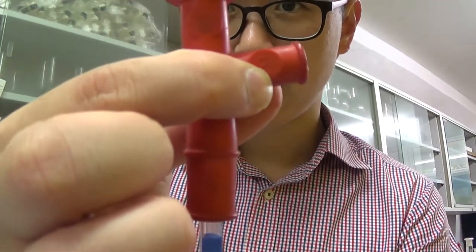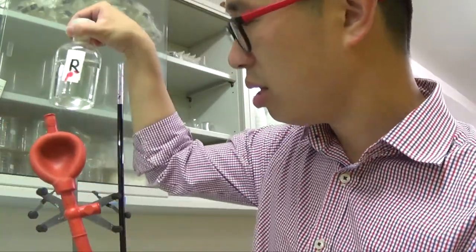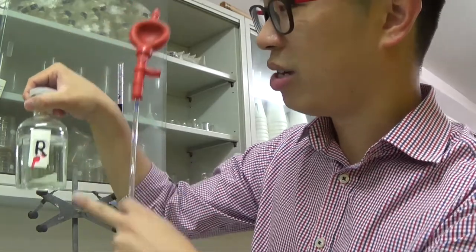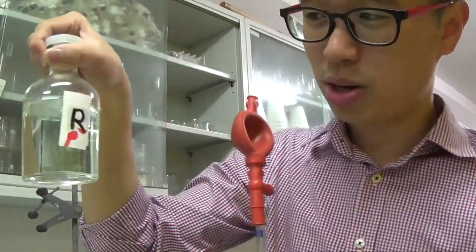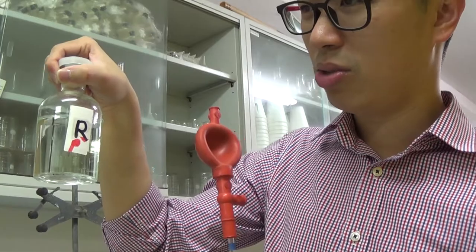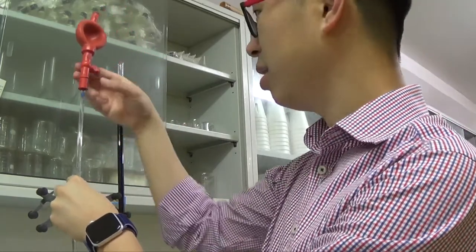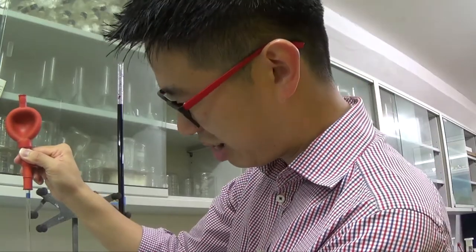All right, so this is still compressed. E stands for eject, S stands for suck. So I'm going to suck it straight from the reagent bottle. But when you suck it in, do not ever eject it into here again, because whatever goes into the pipette, you do not want to put it back into your reagent bottle. But what you can do is suck it out and chuck it into another flask, or into the sink, all right? Typically speaking, we don't throw away solution into the sink.